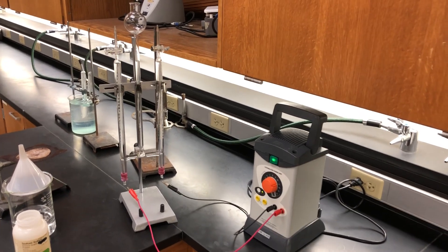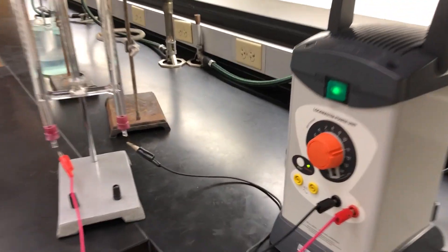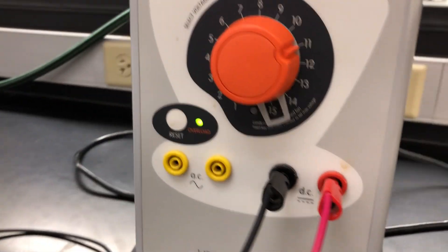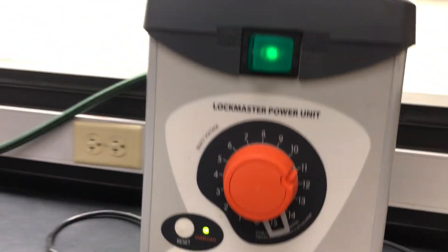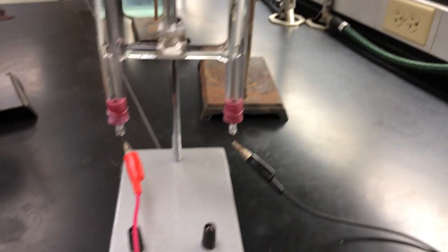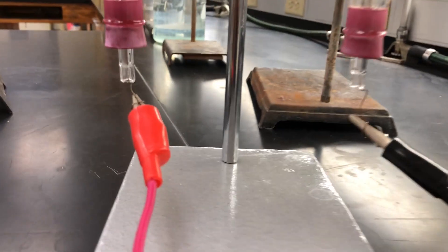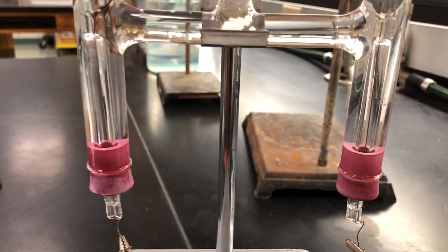Electrolysis of water. We've got a DC power supply set to 11 volts, and a Hoffman tube with power supply connected at the bottom, and a couple of electrodes there.